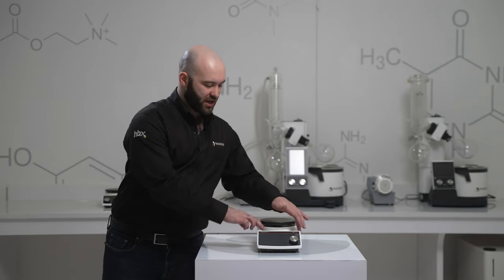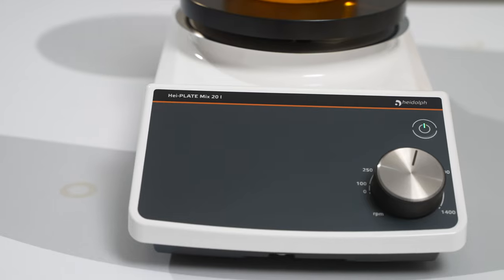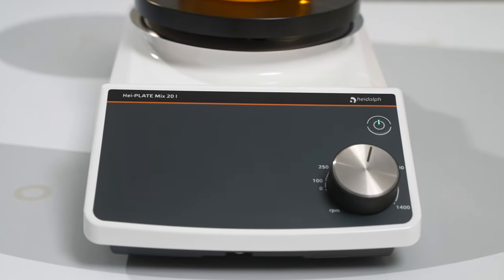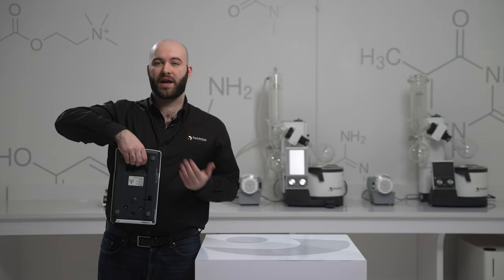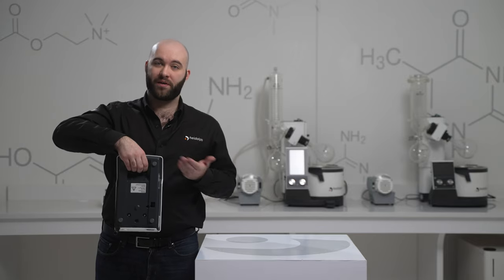The first update was a change to the shape of the hotplate so it can be better protected from spills. Along with shape changes, we also added an ergonomic handle for better transporting of your hotplate.